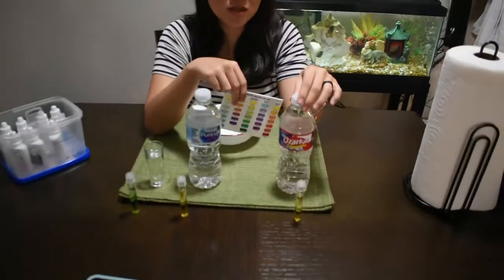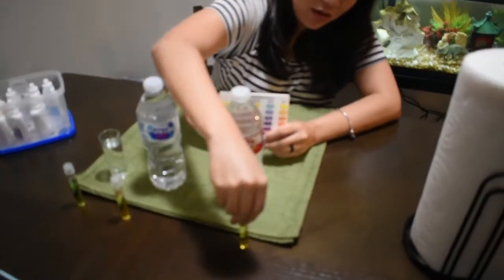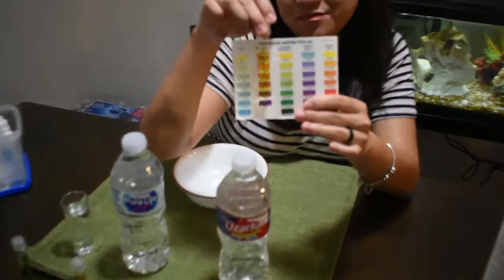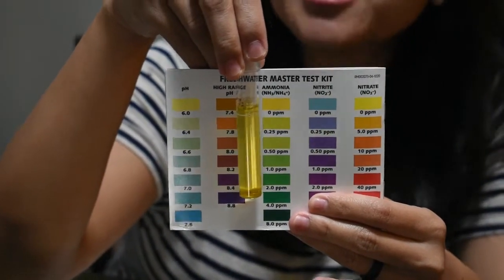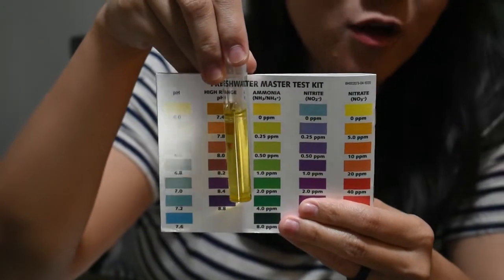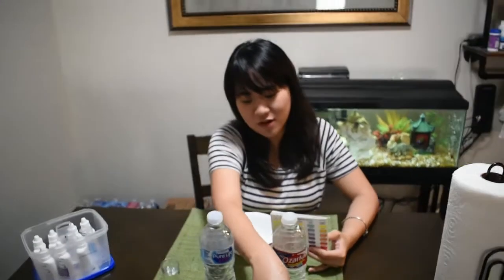Let's see the test result for the spring water Ozarka. And the result is, can you see? Yep, it's the same as Nestle. So it's good and safe for you guys. No ammonia in it. So if you guys have or drink another water, a different brand than these two, feel free to try or test it if you want, just for fun, you know.